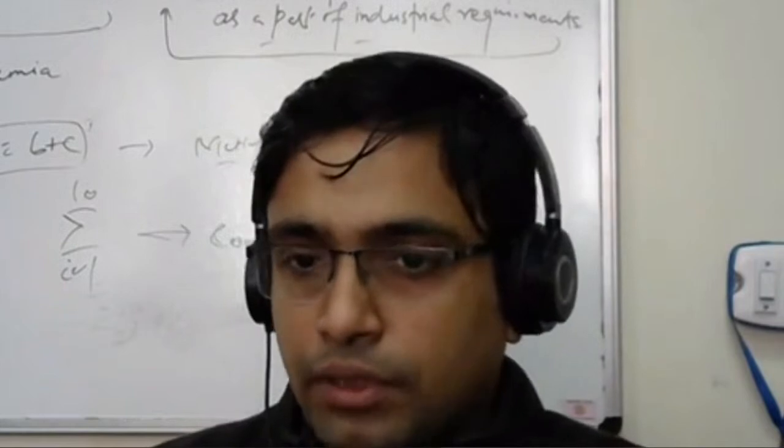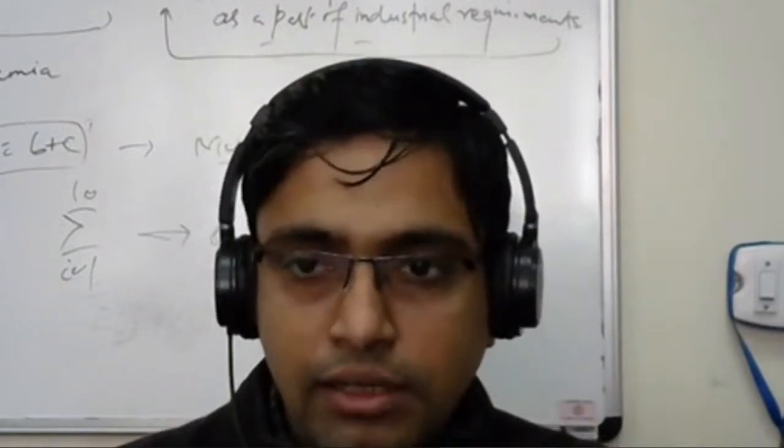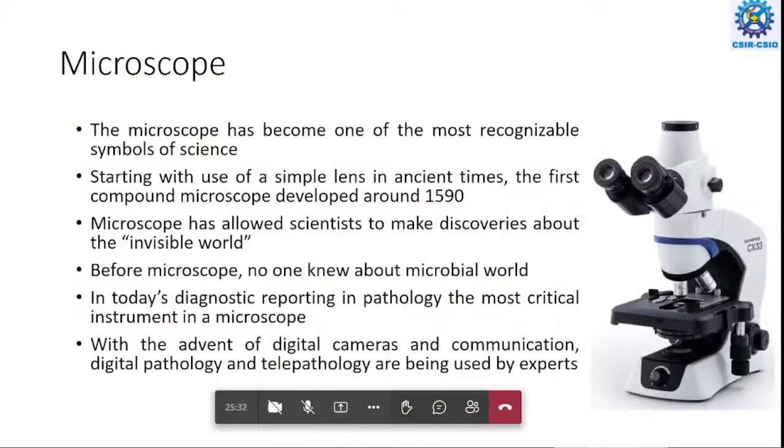Students in school have seen the microscope in their lab. Basically, any object which is very small, which we cannot see with our naked eye, can be seen through a microscope. It is used across different domains of science, and it has proven to be the most useful device across all sectors of science.